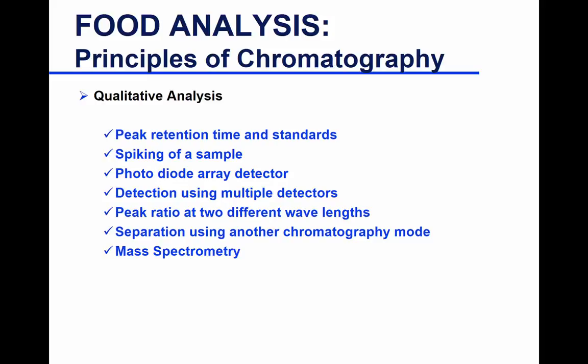So this gives you absorbances, this is like 350, let's say, or 52. You'll see that at different wavelengths, and here you don't have any absorbance, let's say at 380, nothing, zero. So for every compound that is eluting and leaving the column, it gives you a fingerprint of it. Another sample might have this kind of spectra, with a peak at 320 nanometer. So each compound will have a unique fingerprint of absorbance, so you can identify what you have. So the photodiode array detector, that's one advantage of it.